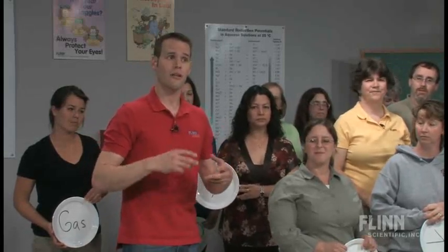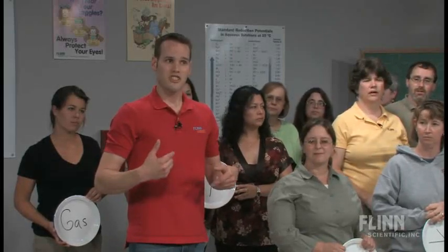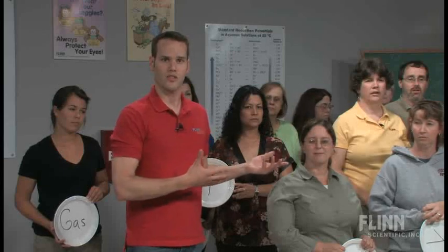We're going to look at this from a computerized probe system, so we'll be back in just a second to show you the reaction using a computerized data collection system in a slightly more mathematical, more graphical, but not quite as visual method. We'll be back in just 1 second.